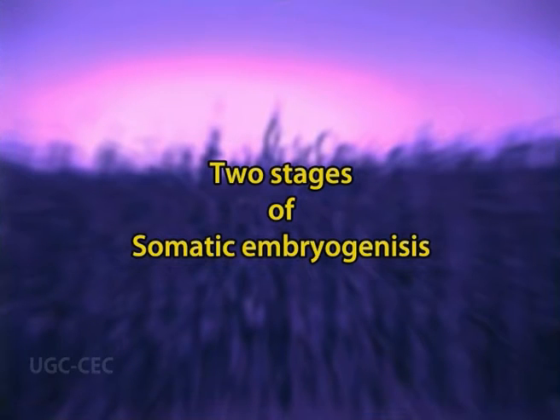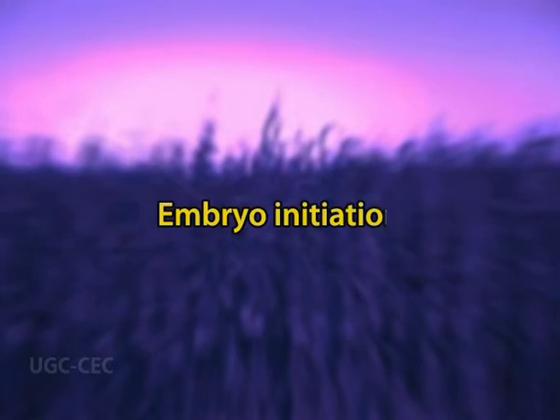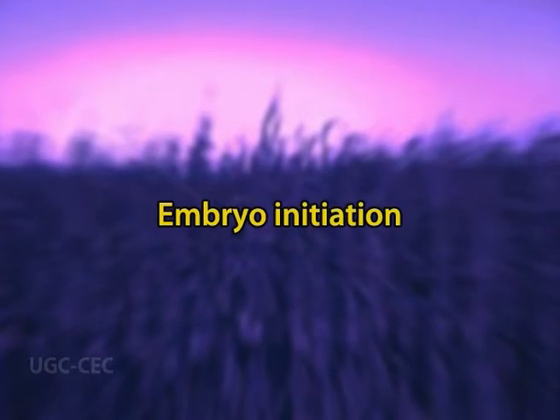Somatic embryogenesis can be divided into two stages. The first stage is the stage of embryo initiation, in which a high concentration of 2,4-dichlorophenoxyacetic acid is used.